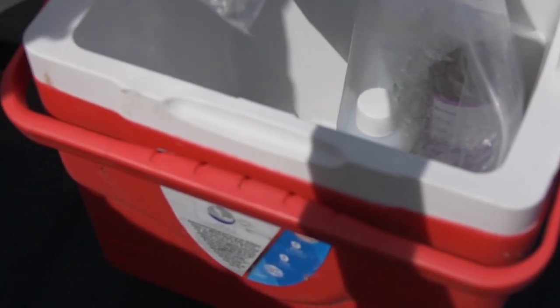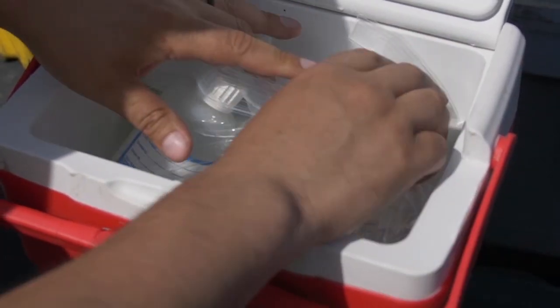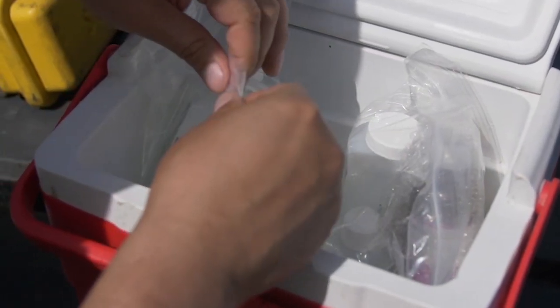The checklist mentions to avoid shipping samples on a Friday or during a scheduled weekend. Try to get them shipped on a Monday or Tuesday, or if you can personally drive them into the lab, that would work best so that you can assure your samples arrive at a certain time.